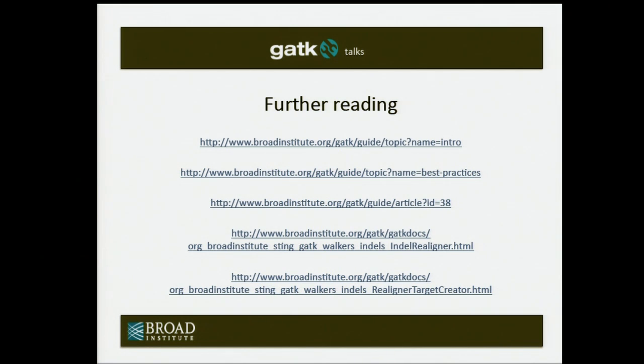I have tried to use the other tool instead, but I think both of them were written by the same person. No, Heng Li didn't write it. Oh, did he? Okay. Well, anyway, I have never had any luck with the BAM files it created. Do you have any comments on that, or can the tools also fix the BAM file created by it? So is that RNA-seq?